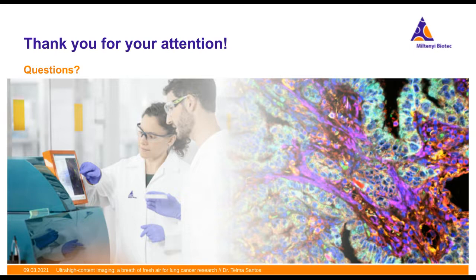Our best resolution currently is a bit more than 400 nanometers with one of our objectives. And the time will really depend a lot on the configuration of your experiment. So the shortest possible cycle could be around 30 minutes, but it will depend on how many antibodies you have in one cycle and how many fields of view you have. So it depends on a variety of parameters.